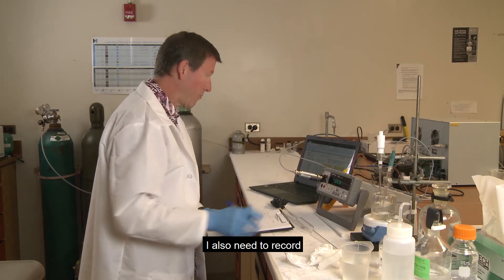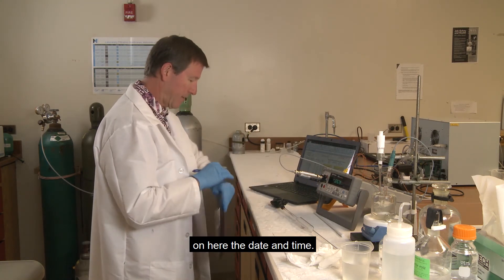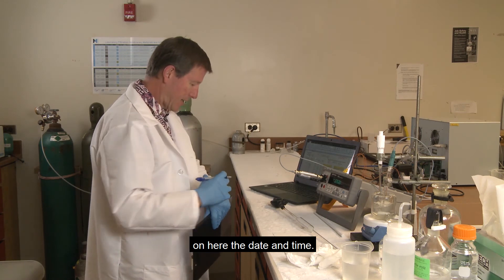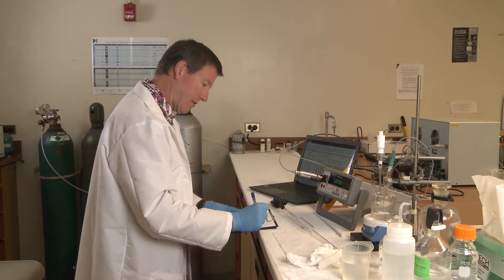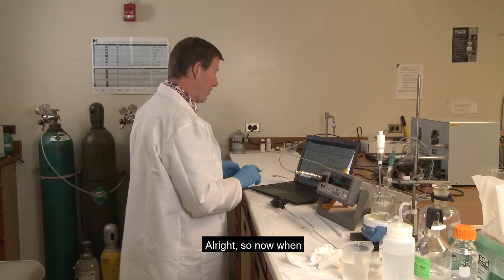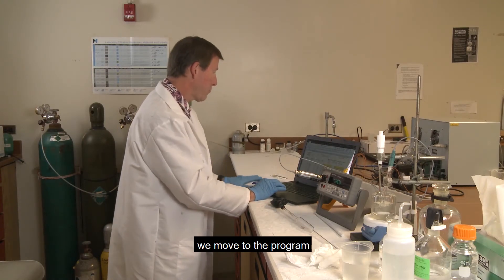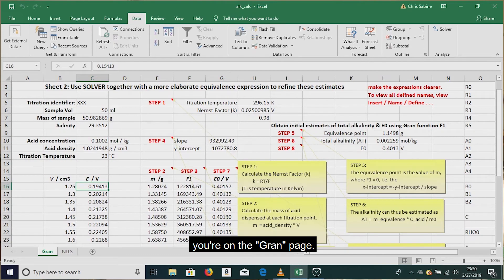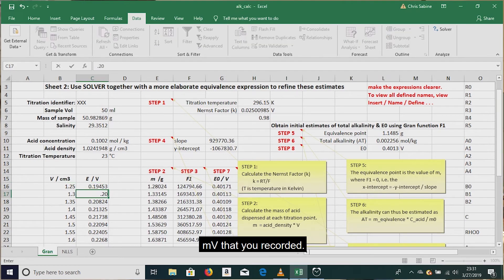I also need to record on here the date and time. All right, so now when we move to the program you want to make sure you're on the Gran page. There's two pages, there's a Gran page and a nonlinear least squares page. So make sure you're always typing on the Gran page and it'll get copied over to the nonlinear side. So next to each volume you want to enter your millivolts that you recorded.